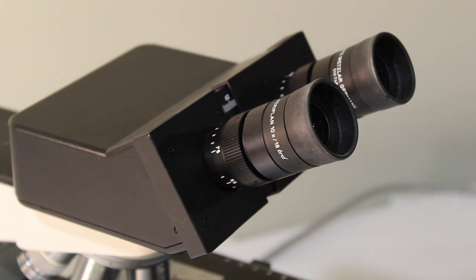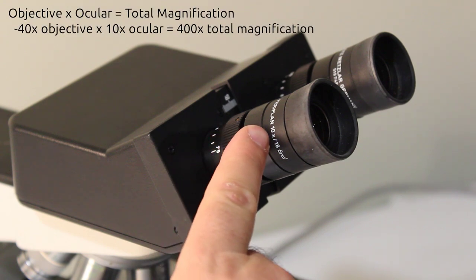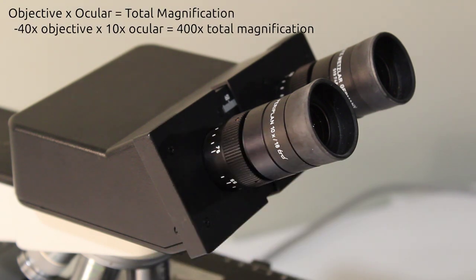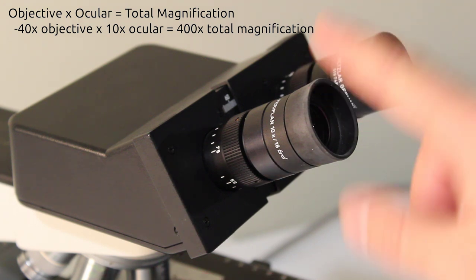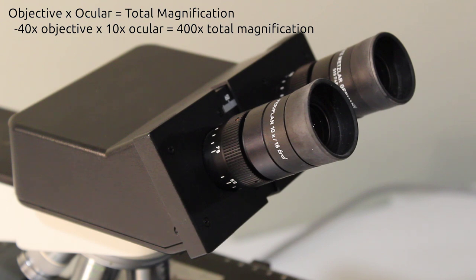The first is they actually help determine your total magnification. So for example here I have a 10x ocular so the total magnification of my microscope will be the magnification of the objective lens multiplied by the magnification of the ocular. So for example a 40x lens and a 10x ocular would give you 400 times total magnification.